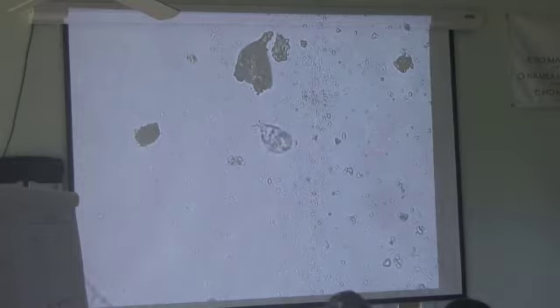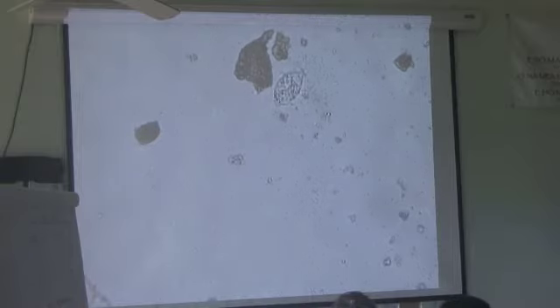So, can you imagine how much time you're going to sit in the understanding the stuff that's going on. And so now when you're looking at your bacteria, we've got some little rod shape, two small rod shape things together. Another couple little rods, cocci, cocci, cocci, littler cocci. So all the diversity of bacteria in here is pretty good. That's quite nice. And then we got a cilia.